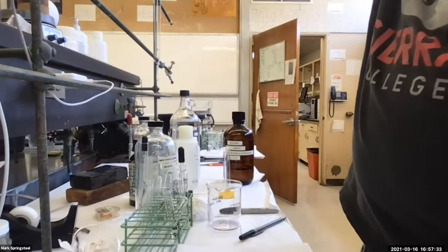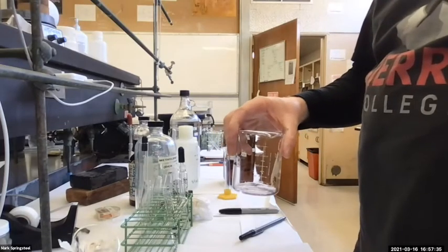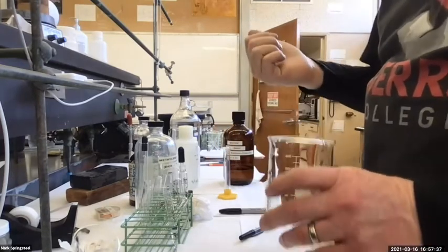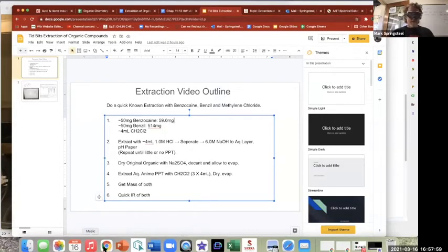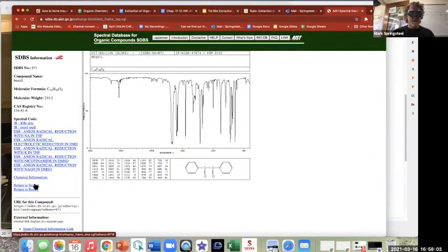Okay, so I think I'll pause there. I'll finish up this guy's evaporation, massing, and get an IR of it. Oh, you know what? I'll show you one other thing really quick, before I let you go. I'll show you what I was talking about, the IRs. So I'll share my screen again. Let's go back to SDBS.